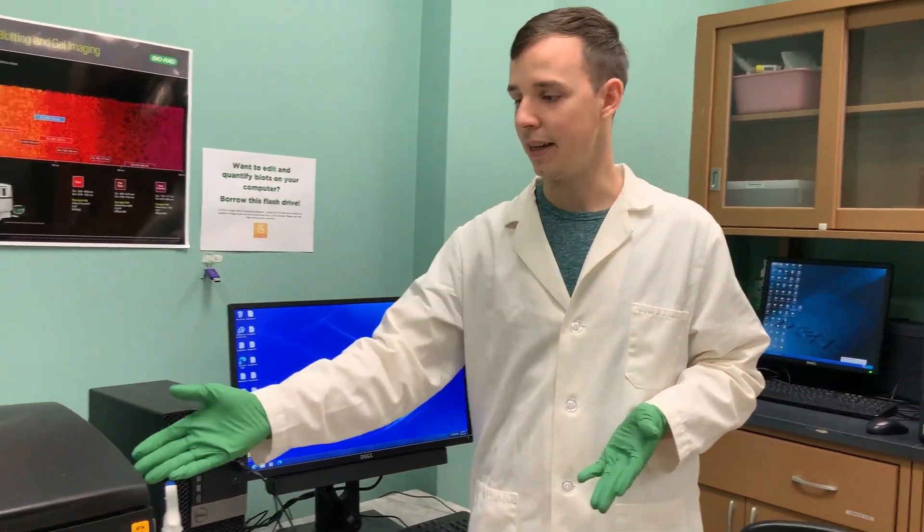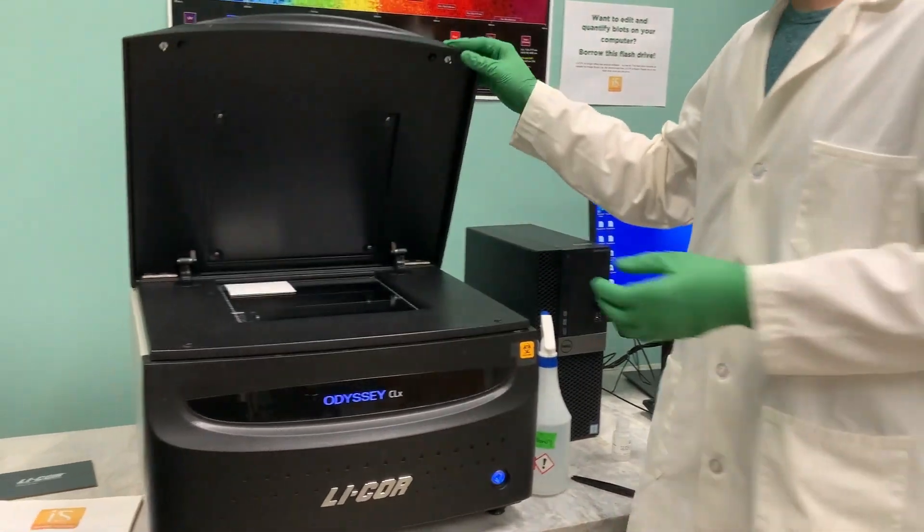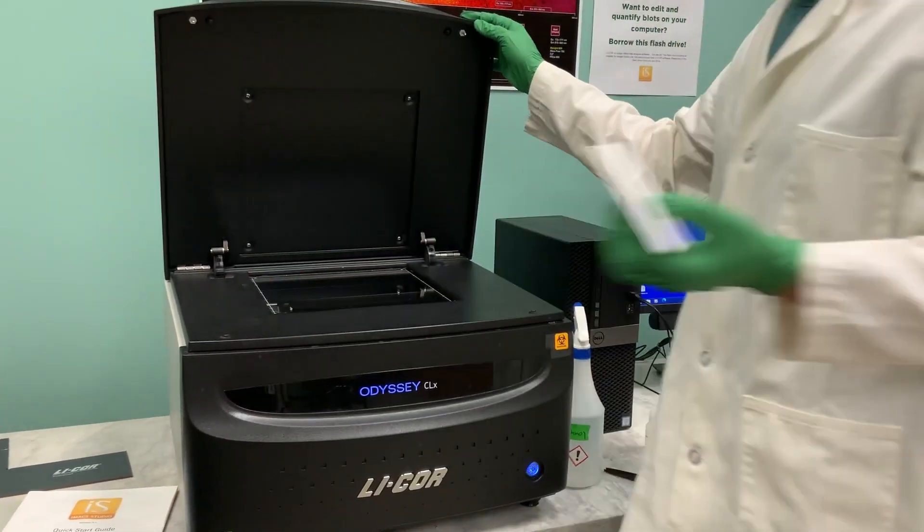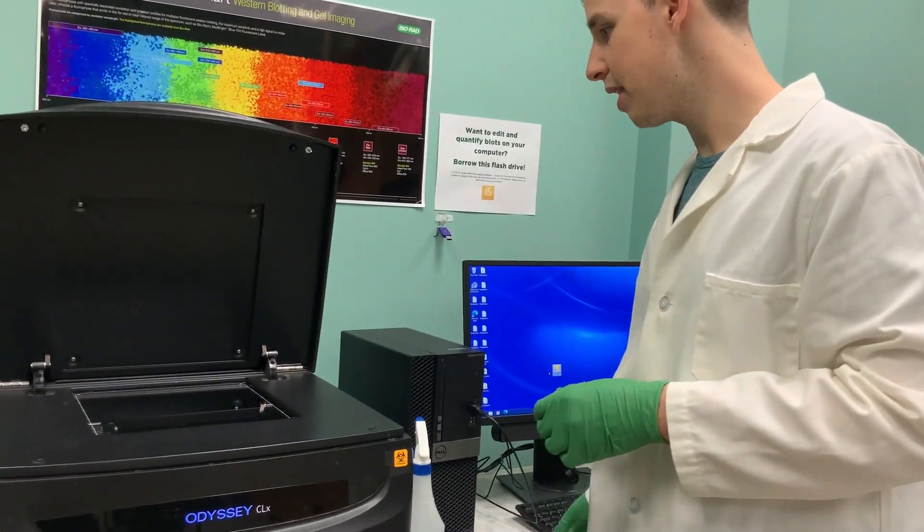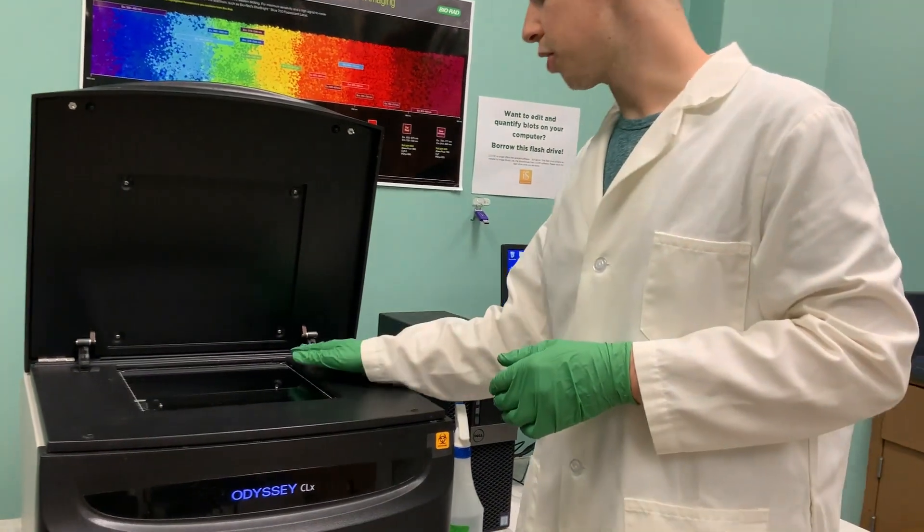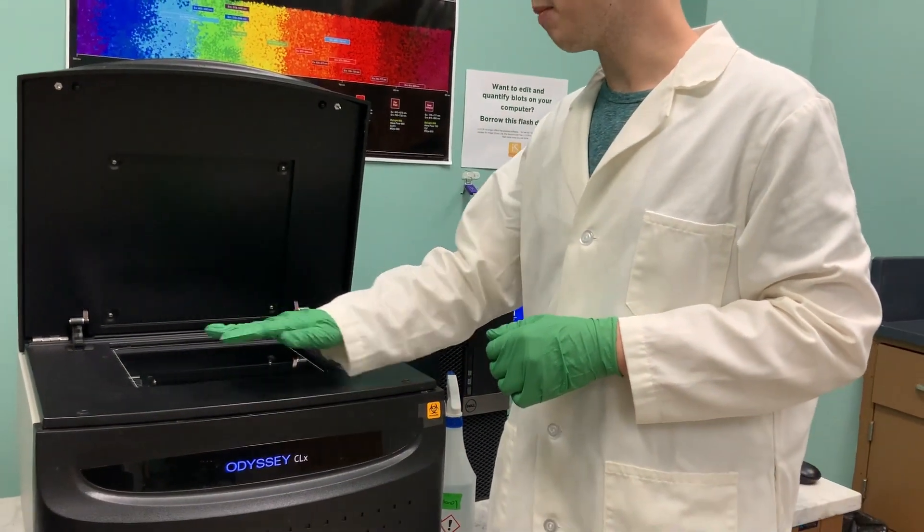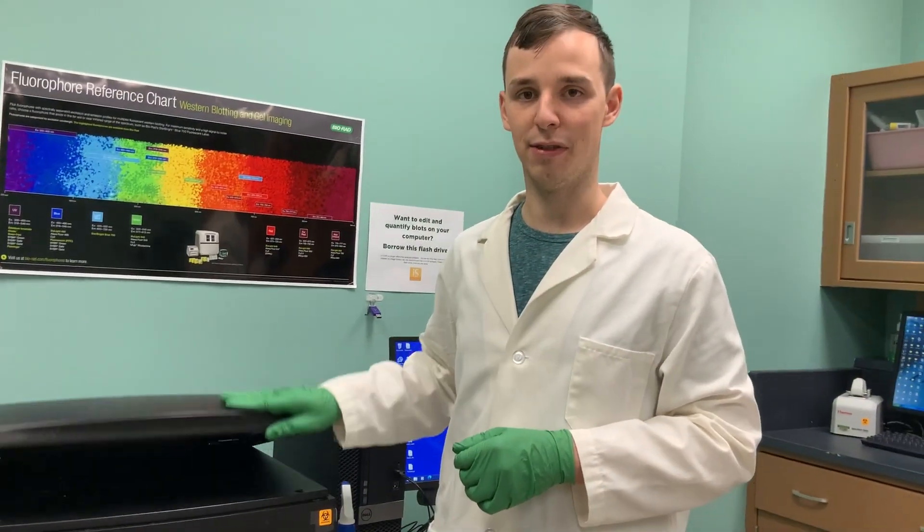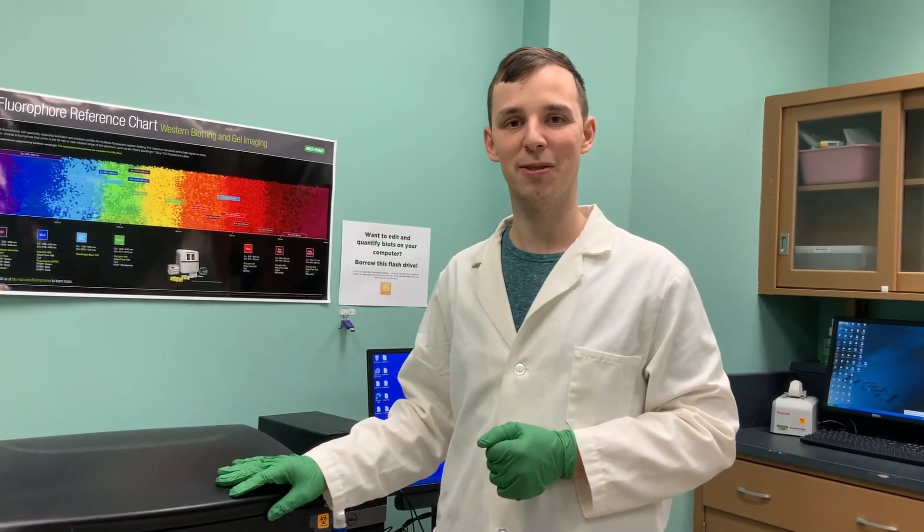Remember to take your membrane out of the machine. Don't pick it up with your hands like I just did. If there's gunk left on here, take a kim wipe and ethanol and clean off the surface. Let us know if you have any questions.